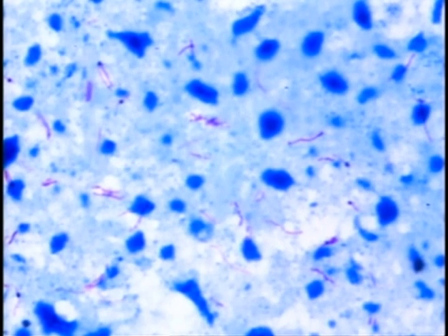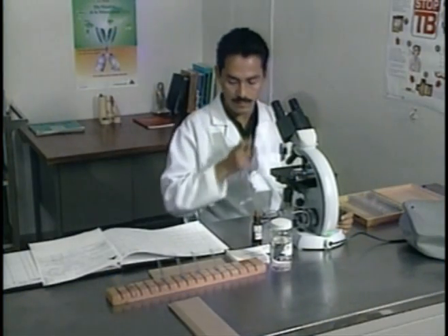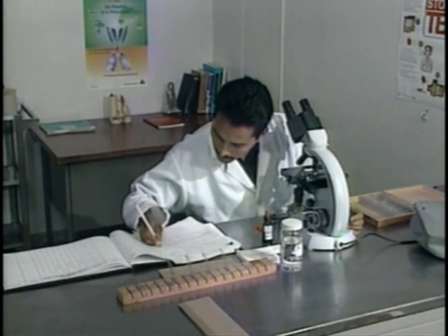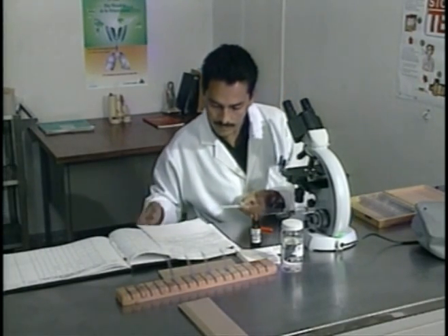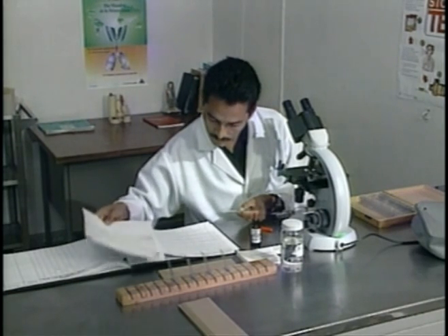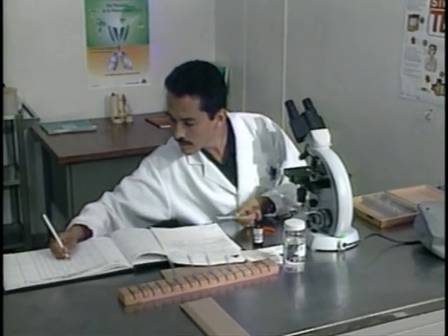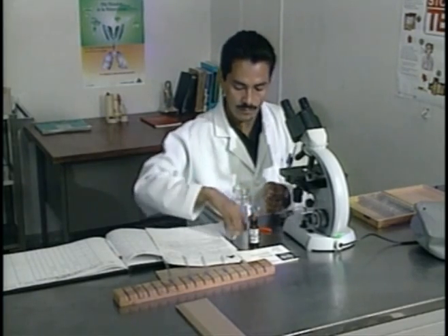Tubercle bacilli resemble fine red rods standing out against the blue background. They may be slightly curved, granular, and may occur singly, in pairs, or groups. Count the number of AFB per field and record this figure on the lab report. After examining the slide thoroughly, remove it carefully from the microscope stage. Check the slide number again and enter the result immediately into the lab register. After completing the reading, remove the oil from the slide with organic solvent.